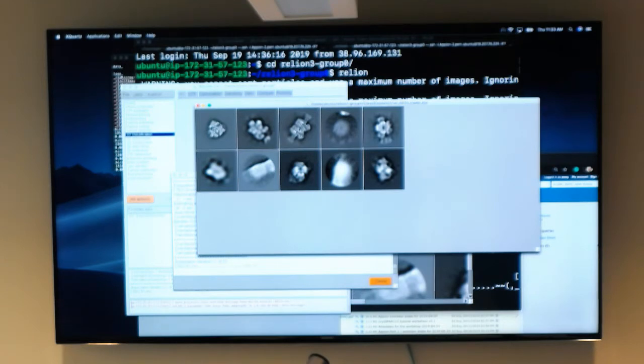And that might be insufficient, and you might have to do some more analysis, like focus classification, like focus on an area where that particular component is or is not. Right, so that gives you a softer approach where in initial phases, it's actually okay to be very brute force, very black and white, saying like, okay, this is a particle, this is not a particle, this is what I'm interested in, what I'm not interested in. However, as people work on more complex systems with greater dynamics, it becomes very tricky to sort out what is of use and not of use.